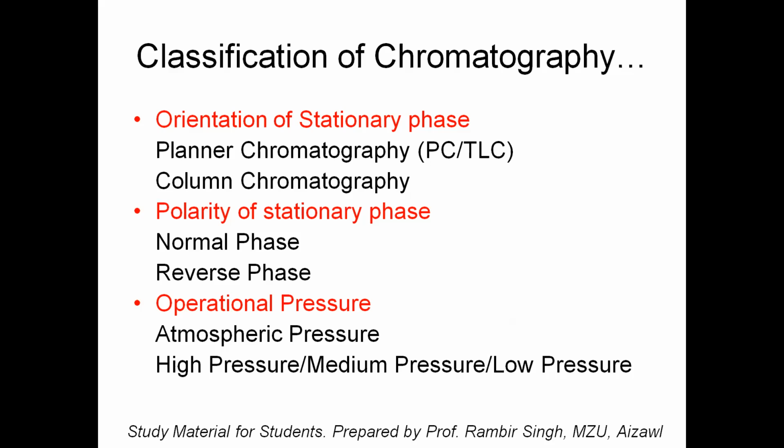I think you might have seen the TLC plates. Have you seen TLC plates? TLC means the chromatography is planar in nature. Or the stationary phase may be oriented inside a column, like what Michael Tswett invented, which was column chromatography.